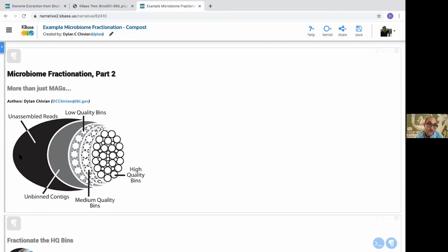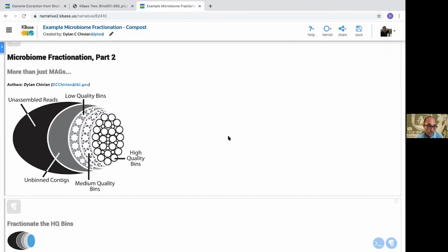But again, remember, they didn't assemble, which means they didn't have a lot of read depth in that lineage, which means you're not going to get multiple observations that support an assignment of a lineage. So it's probably going to wind up a bit scattered, a lot of the tail, that sort of thing. But it may be numerically abundant collectively, right? It may carry important function collectively. So you can't just discard it. We need to pay attention to it and appreciate it.